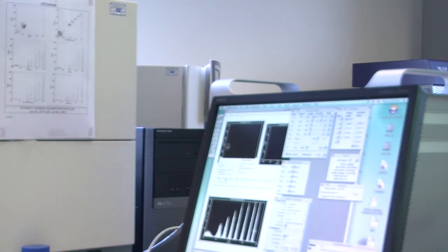So what you can see on there is a quadrant where the plot is divided into 4. Not necessarily equal 4s, but 4. Generally, when people use quadrants, anything in the bottom left quadrant is a double negative. It has neither of those markers. This one and this one are single positives. It has that marker but not the other one, or that marker but not the other one. The ones in this quadrant are double positives. They have both markers.